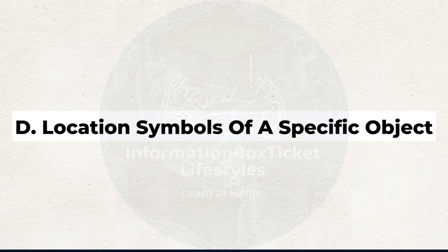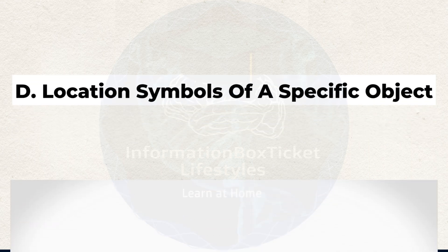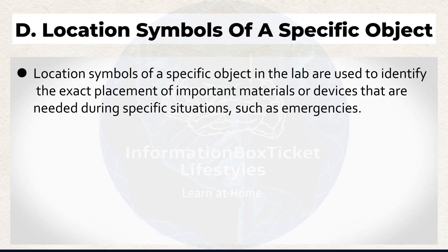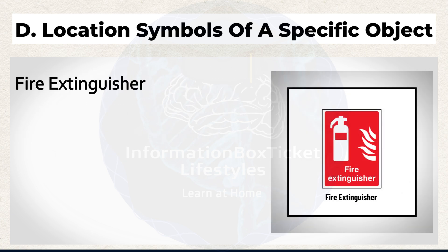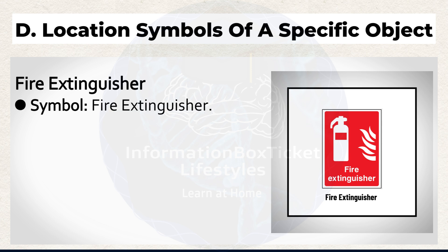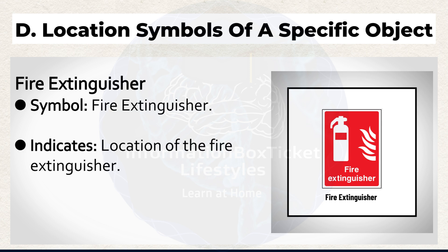D. Location symbols of a specific object in the lab are used to identify the exact placement of important materials or devices that are needed during specific situations, such as emergencies. These include items like first aid kits, fire extinguishers, and emergency bells. Fire Extinguisher symbol indicates the location of the fire extinguisher.